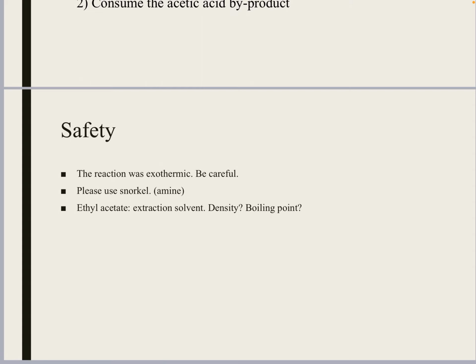All those starting material will be the impurity in your final product, which will show up in the proton NMR and in the FTIR. Okay, so make sure that you swirl the flask. All the liquid will be mixed up evenly to ensure the reaction goes to completion.